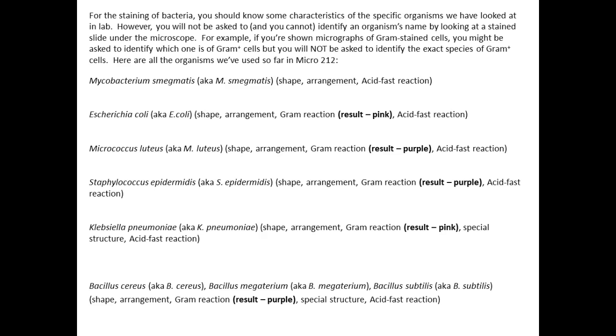Today, we'll use 3 different bacilli: Bacillus cereus, Bacillus megaterium, and Bacillus subtilis.